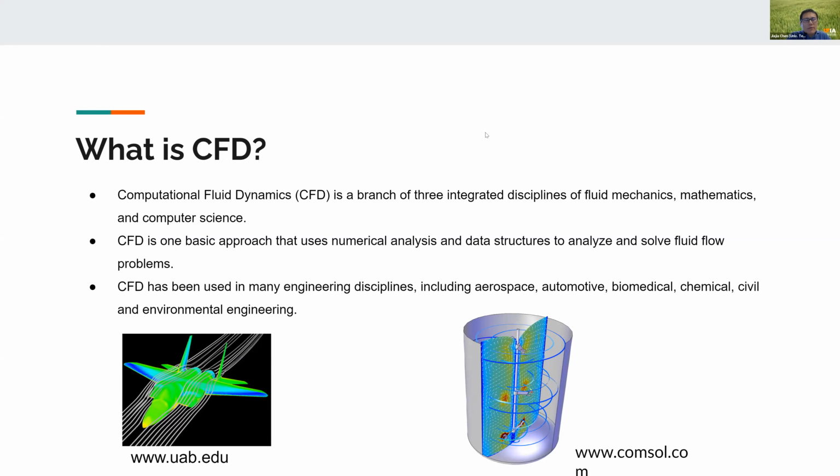So let's first look at what computational fluid dynamics is. Computational fluid dynamics, also known as CFD, is a well-developed branch of the integrated disciplines of fluid dynamics, mathematics, and computer science. CFD is a general approach that uses numerical analysis and data analysis to analyze and solve fluid flow in different types of bioreactors. CFD is already well known for different applications, such as designing airplanes and automobiles, to understand how different equipment or transport systems will behave in air flows. Similarly, CFD is also used widely in bioreactor simulations to understand how the flow behaves in bioreactors.